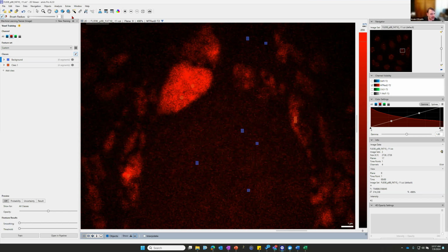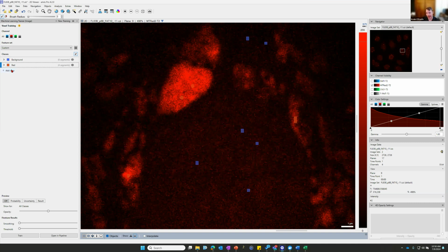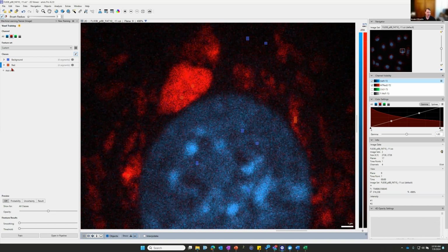Do it on just one channel. I have my custom set, and you can see we have our background in red. We can add more classes. It's personal preference, but let's say we wanted to do machine learning to get out this red channel, and you also want to get out maybe this DAPI. You have the option to add a class, make this DAPI, and then add this channel into it.